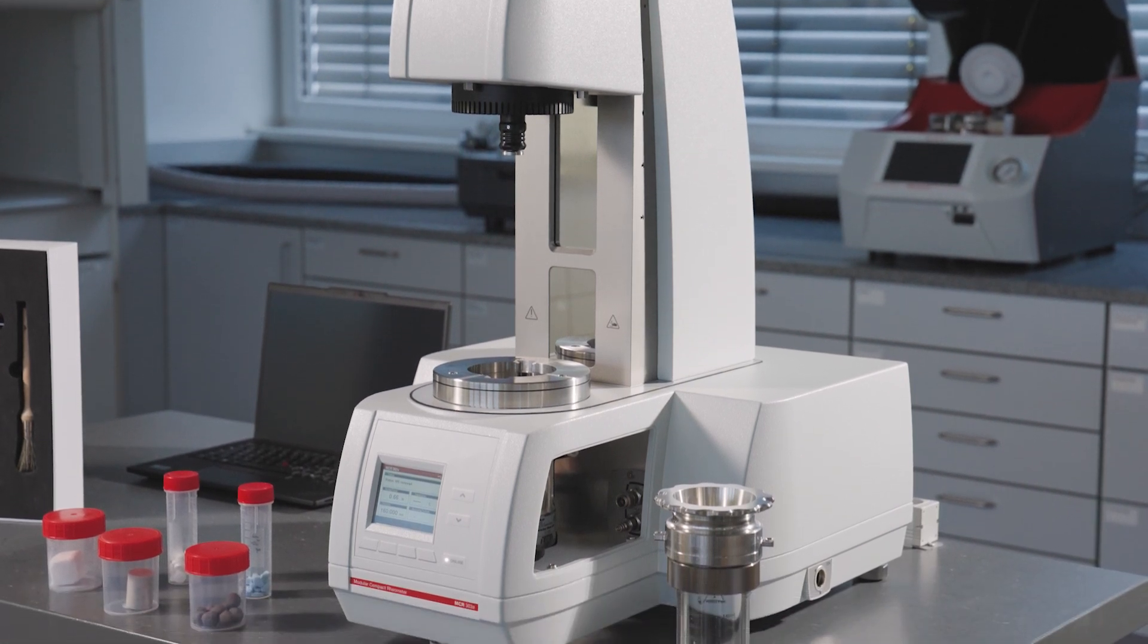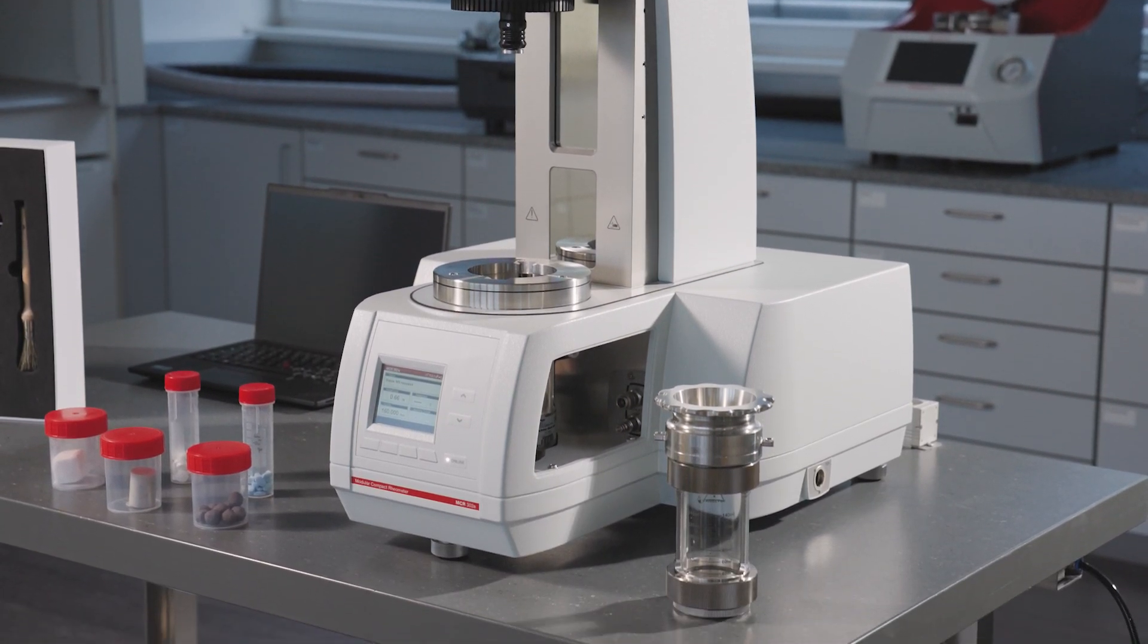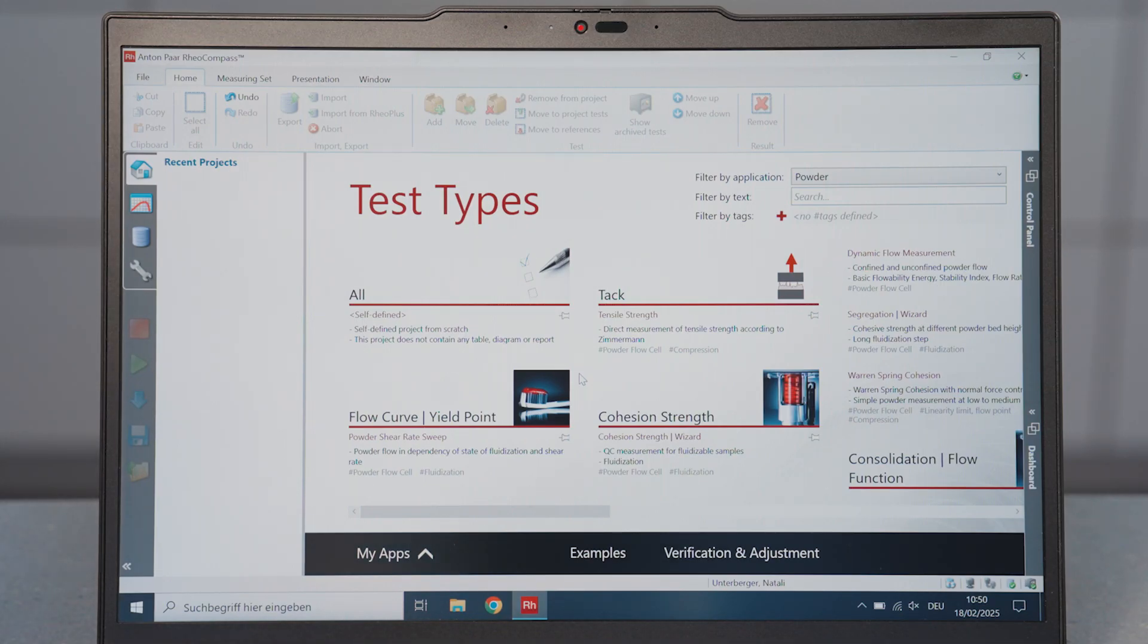Once switched on, connect the instrument with your local workstation. Start the RheoCompass software.